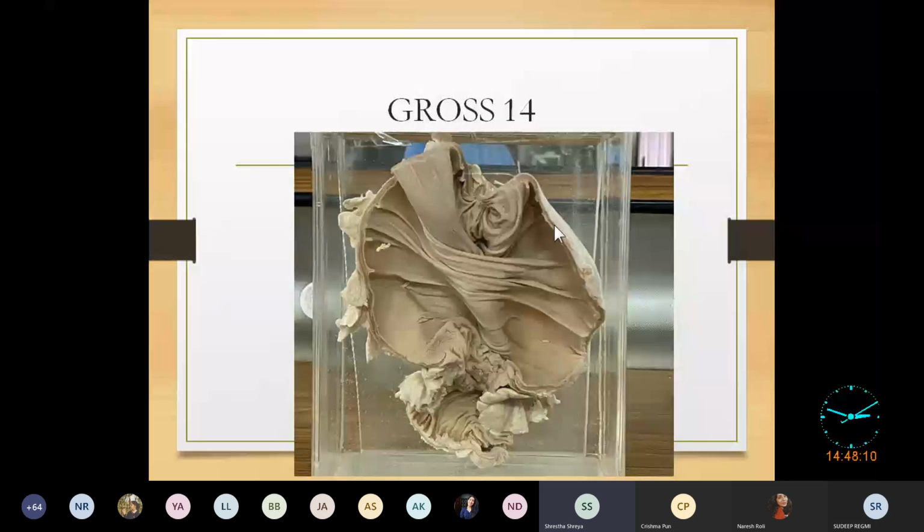Distal carcinoma colon. So what are the features in favor of that diagnosis? There is circumferential growth that constricts the lumen, the area proximal to the growth is dilated, and there is a napkin ring appearance. So this is the area of constriction, which is the tumor.